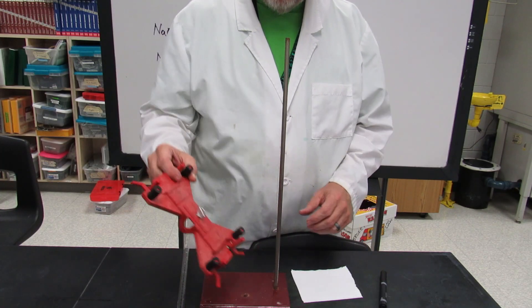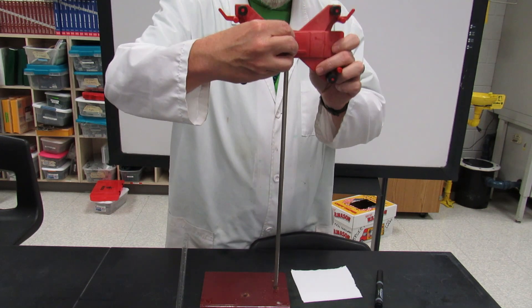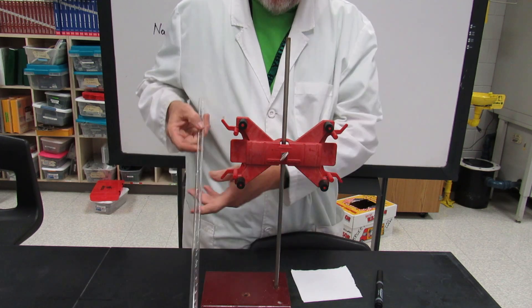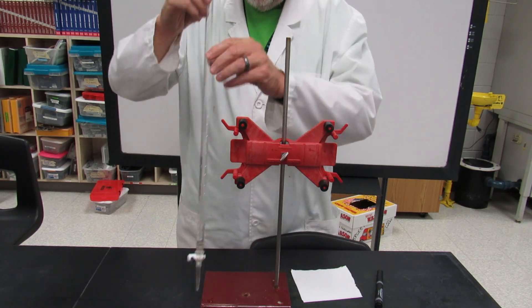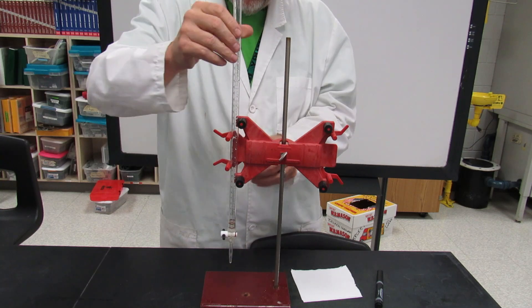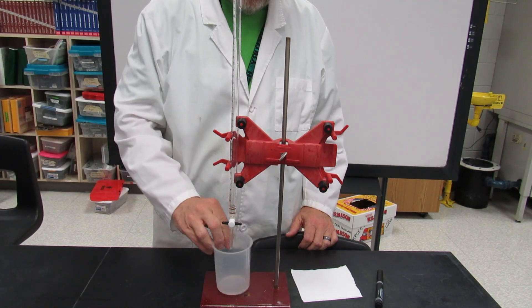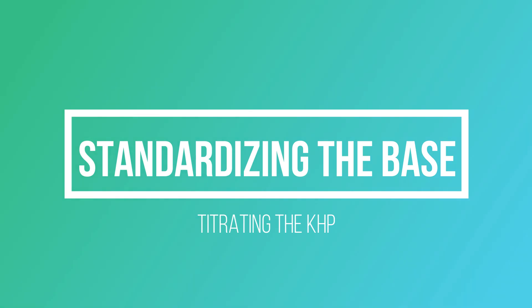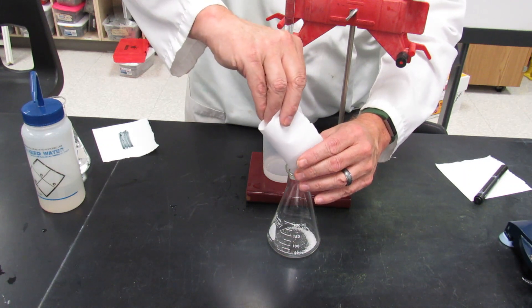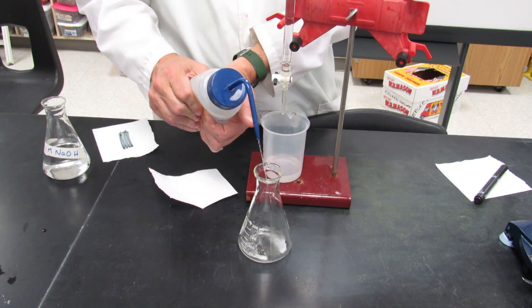To set up the burette, put the burette clamp on the ring stand using the little wing nut, and position it at a nice middle height on the rod. Then place the burette in the clamp with the stopcock on the bottom — squeeze the clamp, insert the burette, and make sure it's snug before letting go. For standardizing the base, take some potassium hydrogen phthalate (KHP) solid, put it into your 250 mL Erlenmeyer flask, and add about 50 mL of deionized water.